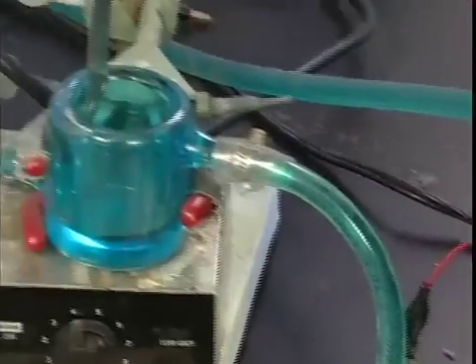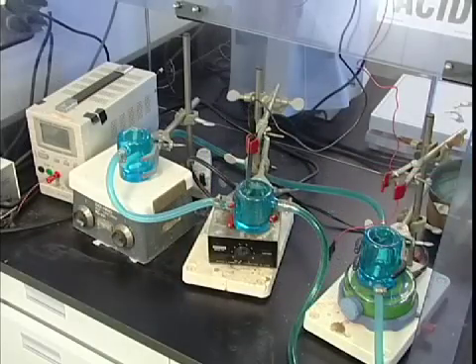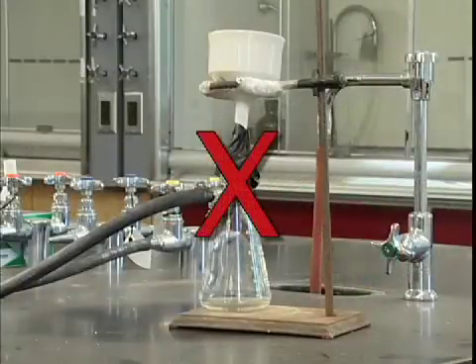Each piece of laboratory glassware is made for a specific purpose, and it's important that we use it only for that purpose. Makeshift apparatus is almost always unstable and is often an accident waiting to happen.